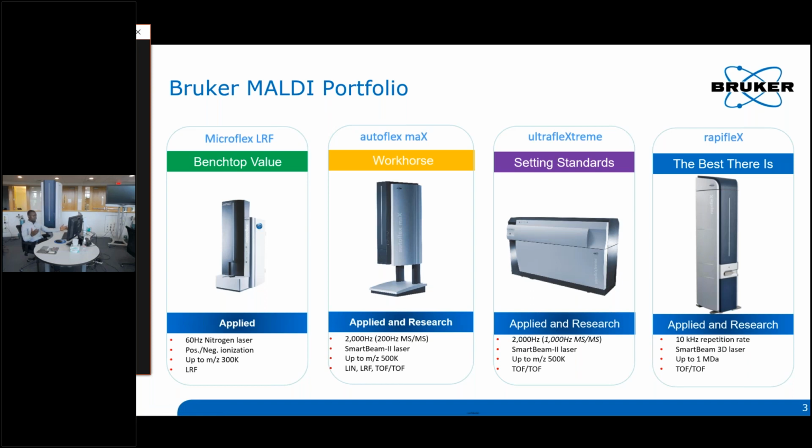This is equipped with the fastest laser in any MALDI instrument ever made, with a repetition rate of up to 10 kilohertz, and can see up to 1 million Dalton m/z.